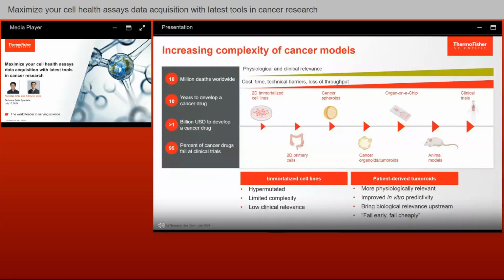In cancer research, scientists use different models to understand how the disease works, from basic cell cultures to animals and even human subjects. For discovery purposes, scientists often rely on 2D and 3D cell models to study cancer biology and test out new drugs. Each of these models has its pros and cons, as indicated on the slide, that researchers should consider carefully before starting an experiment.